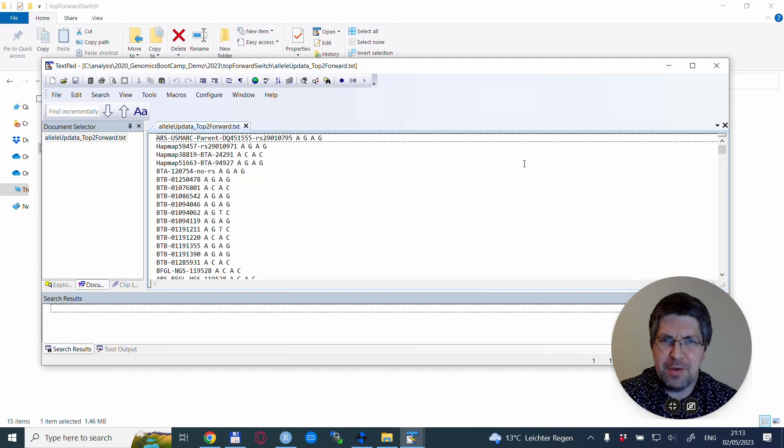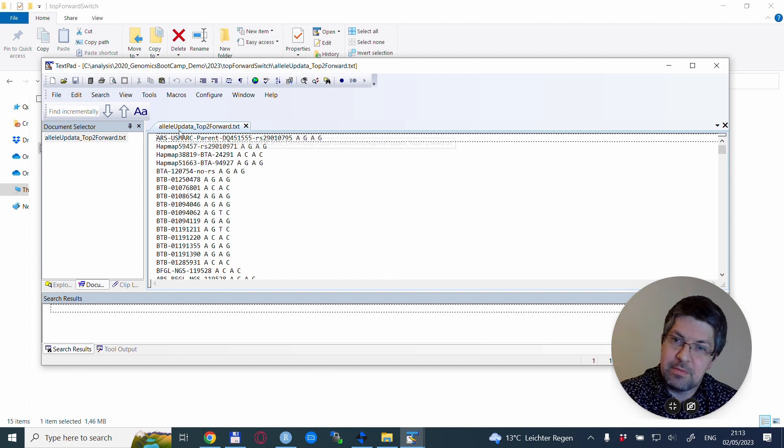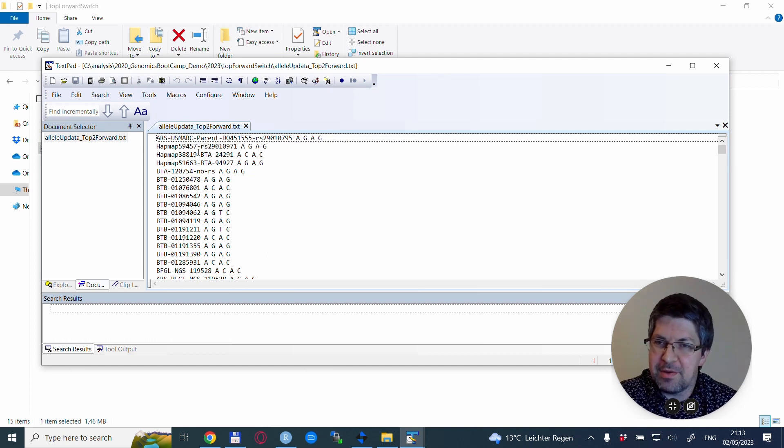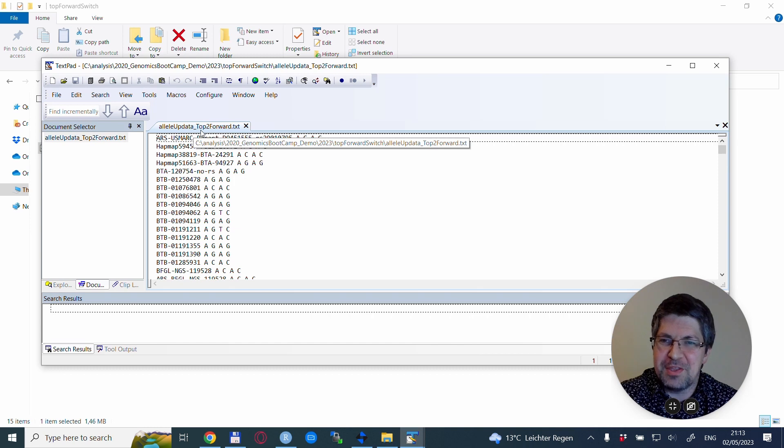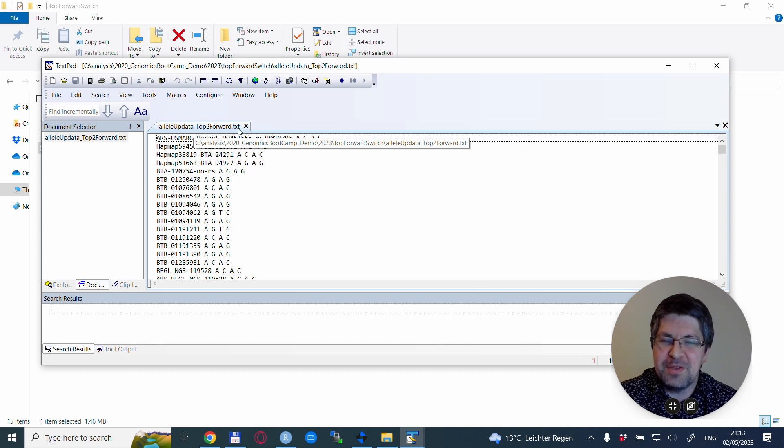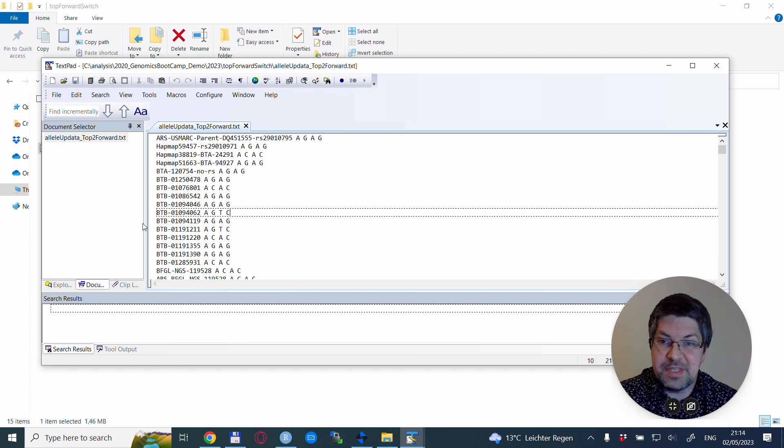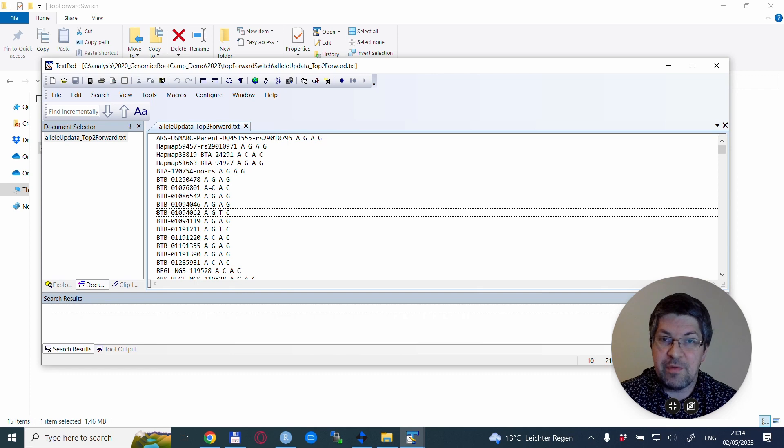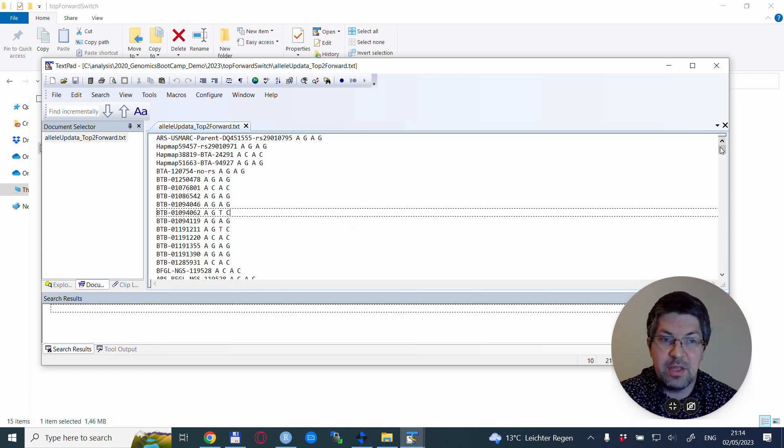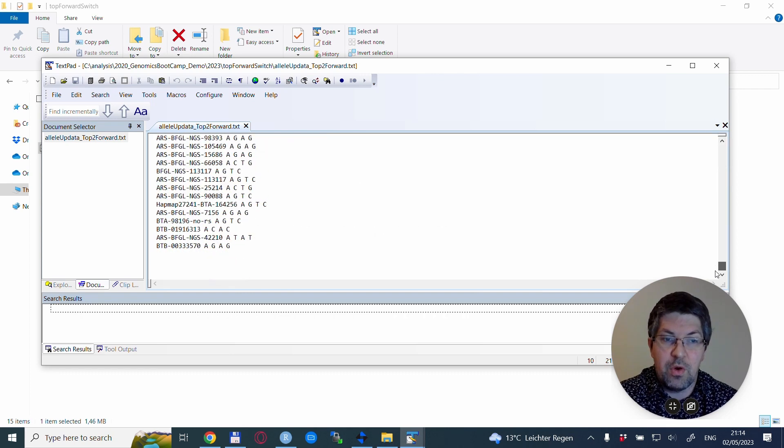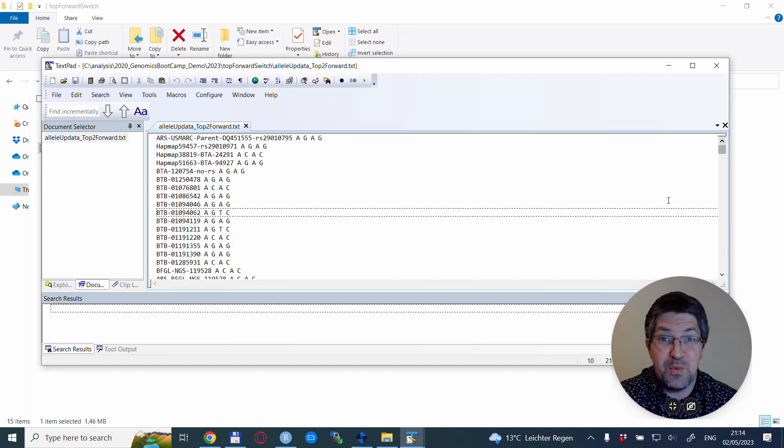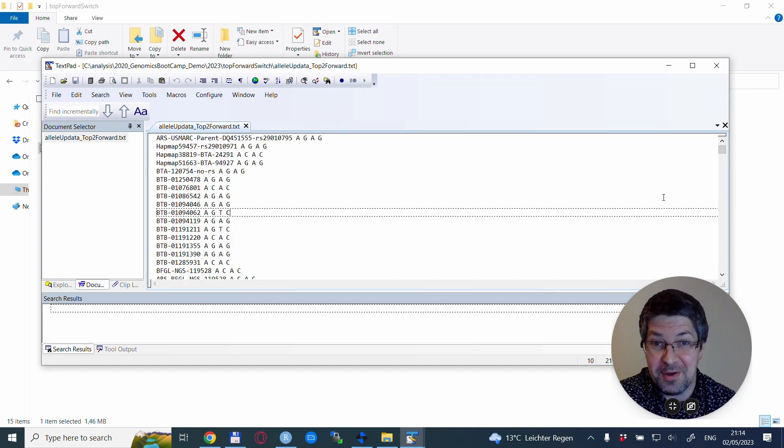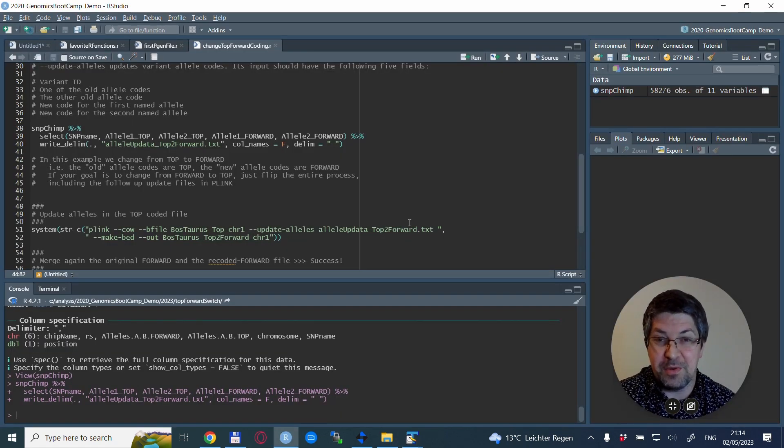You have to keep in mind what you are changing from and what you are changing to, and if you want it differently you adapt this file accordingly. I'll show you briefly how this new file looks like. I named it allele update TOP to forward dot txt. Basically it has these five columns: the SNP name and the two alleles for one allele coding and the two alleles for the other allele coding for all of the 54,000 SNPs on this SNP chip.